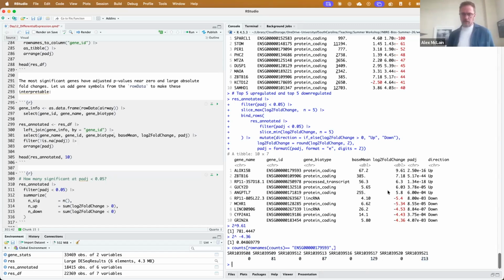And then the treated, we have some counts here, not terribly high counts, but certainly there's a stark difference between those two. So one important thing that this points out is this log2 fold change is more than simply the mean of the treated over the mean of the untreated, because that would not be defined in this case, because the mean of the untreated here would be equal to 0. There's more that goes into it than that. Let's take a look at this second gene that we have.